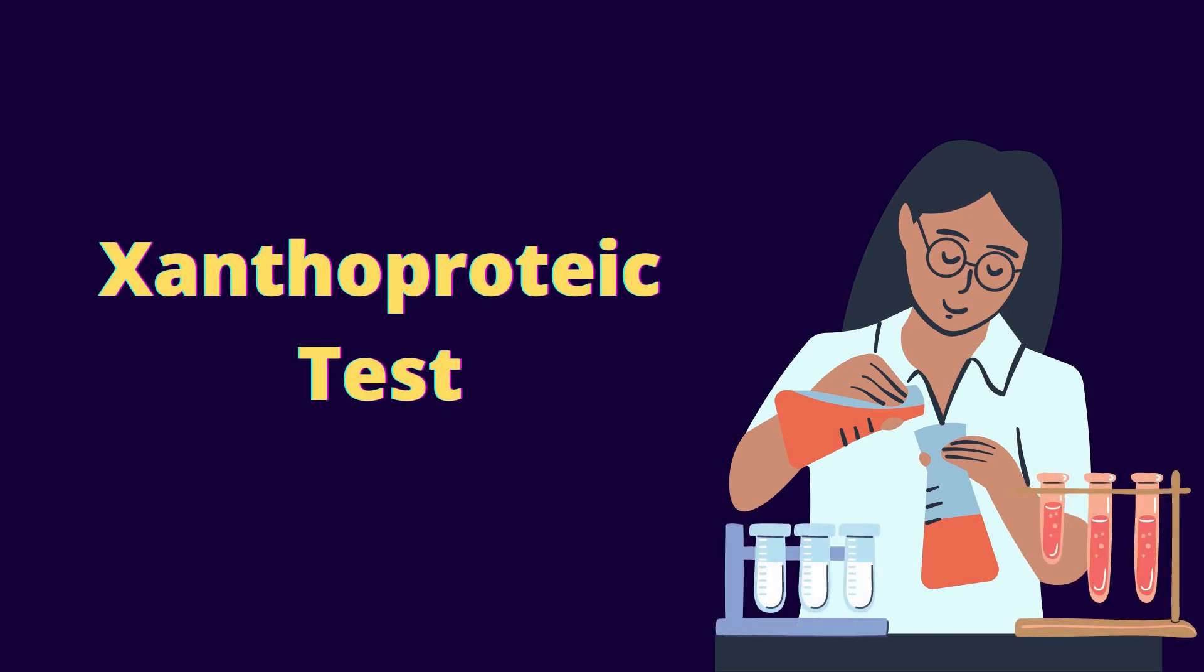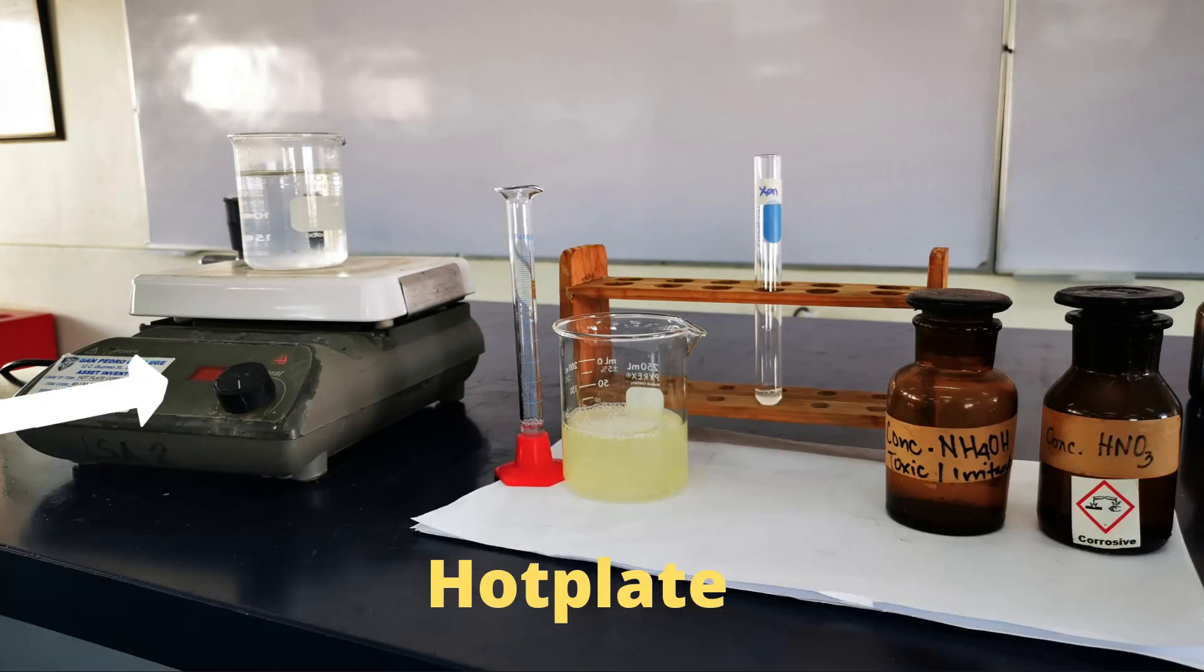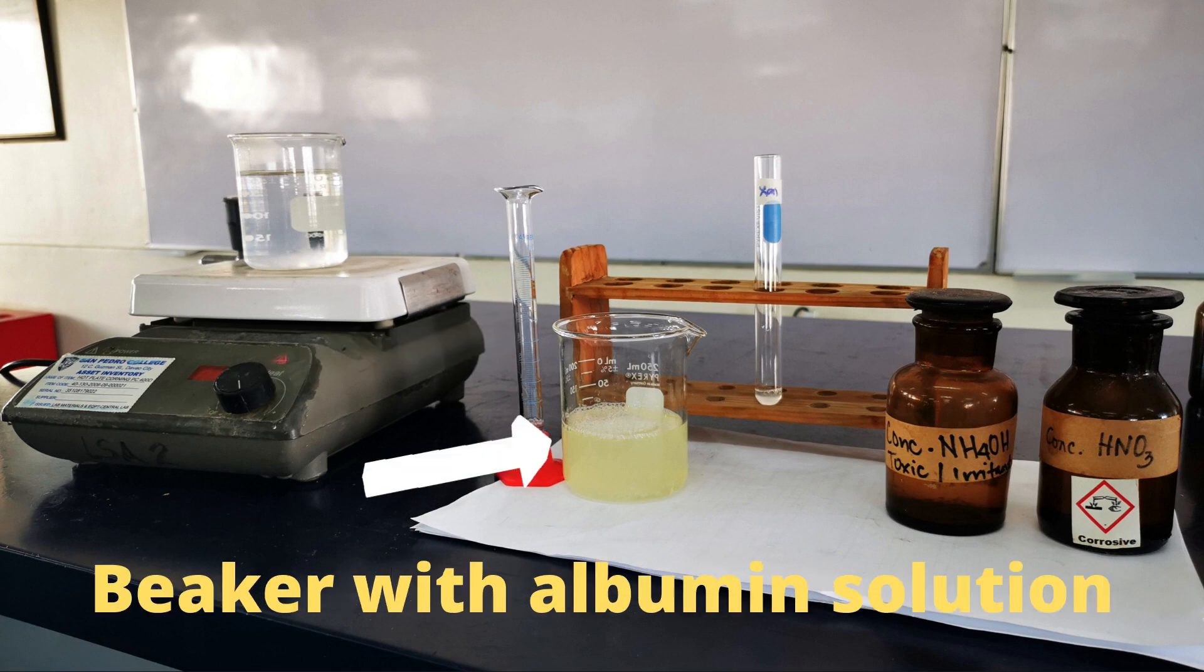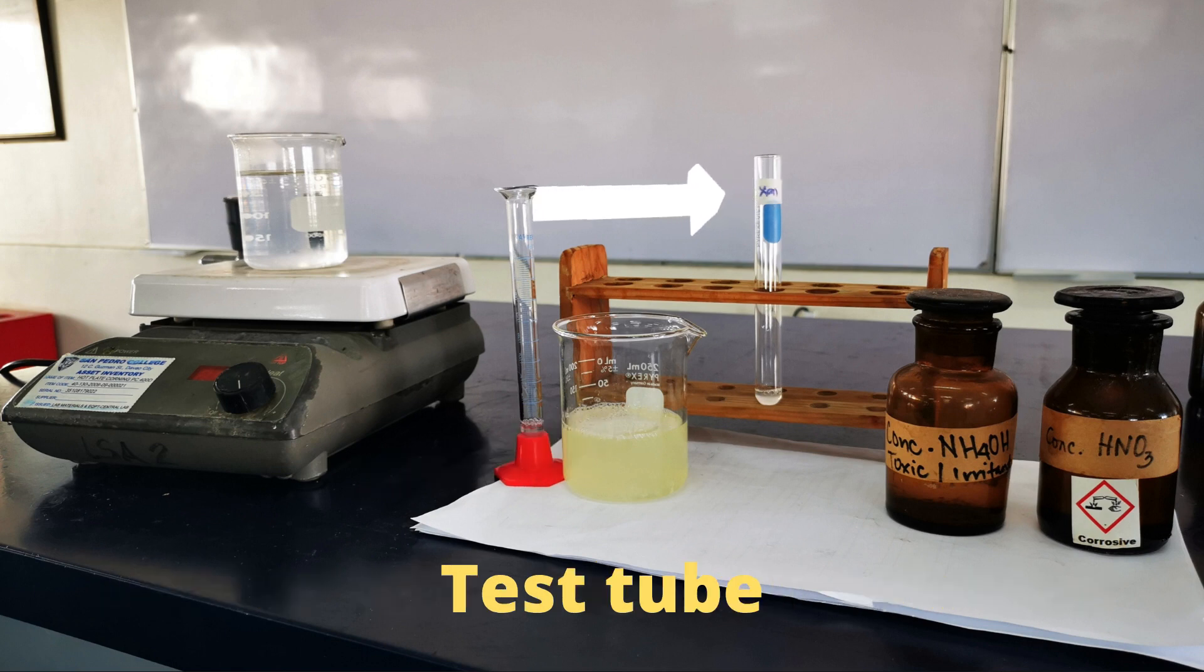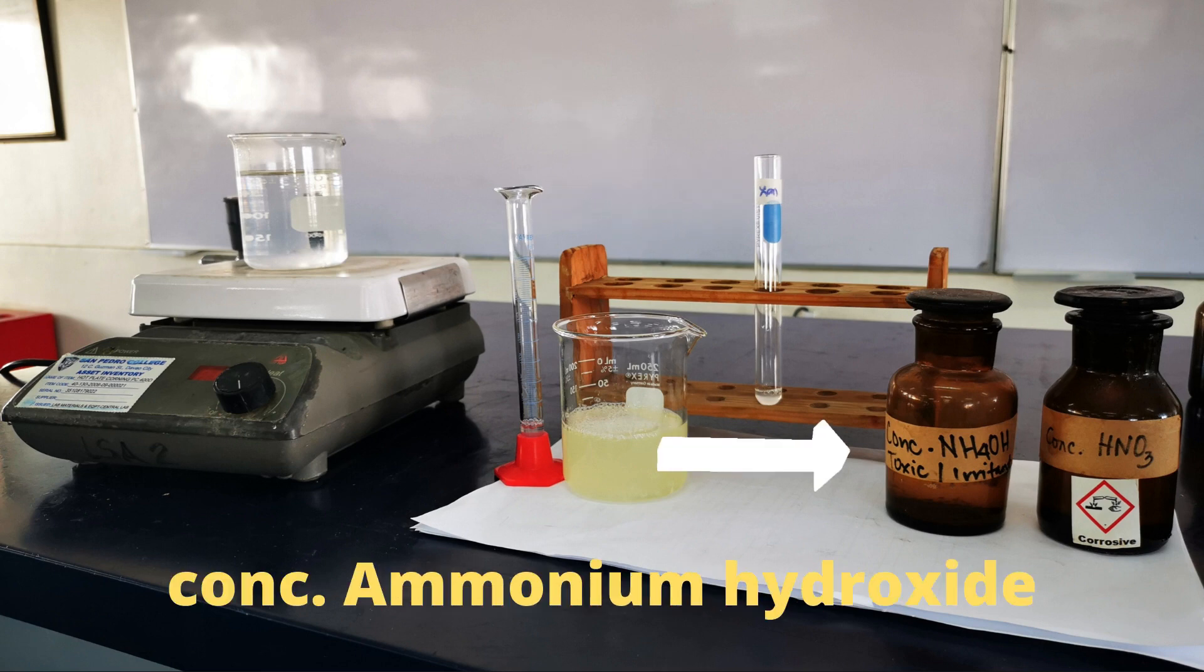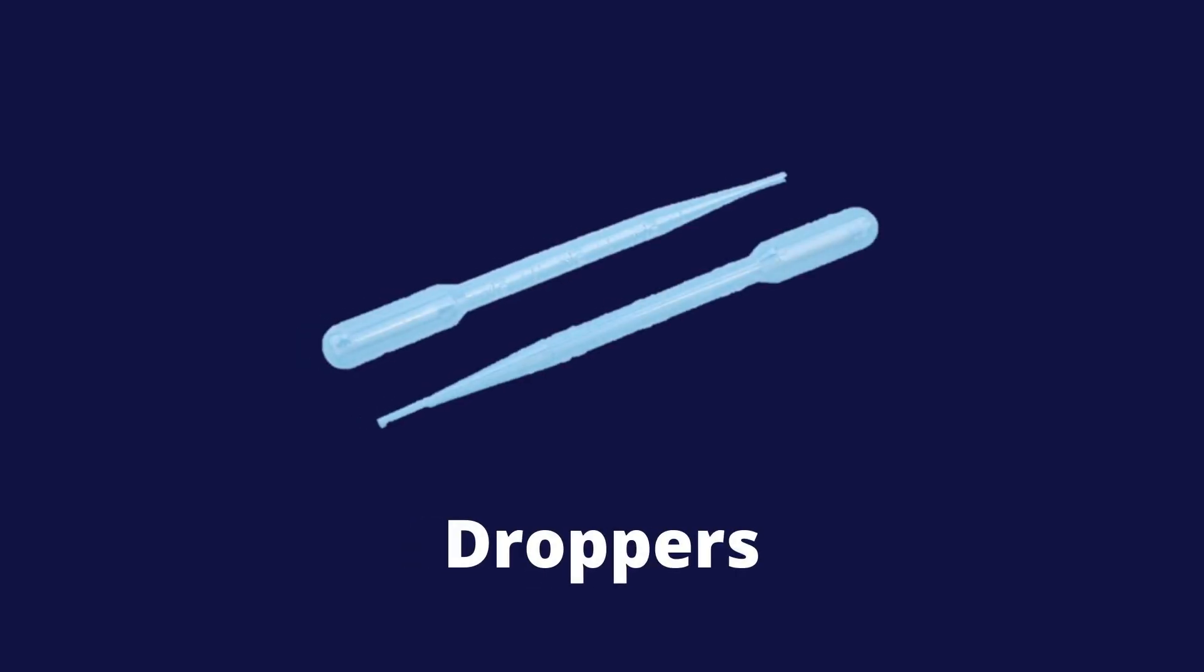Let's start with the xanthoproteic test. These are the materials and reagents for xanthoproteic test: hot plate, graduated cylinder, beaker with albumin solution, test tube, test tube rack, concentrated ammonium hydroxide, concentrated nitric acid, droppers, and label tapes and markers.